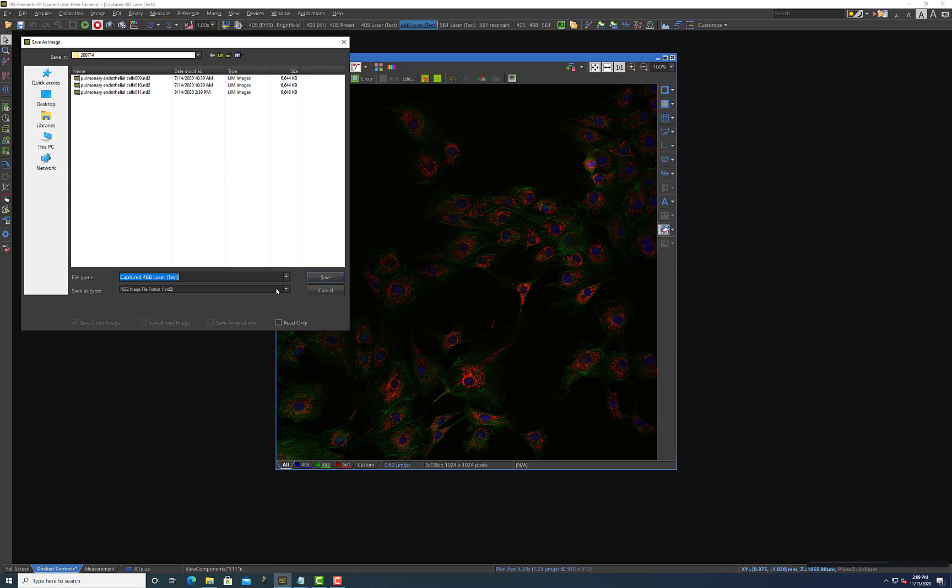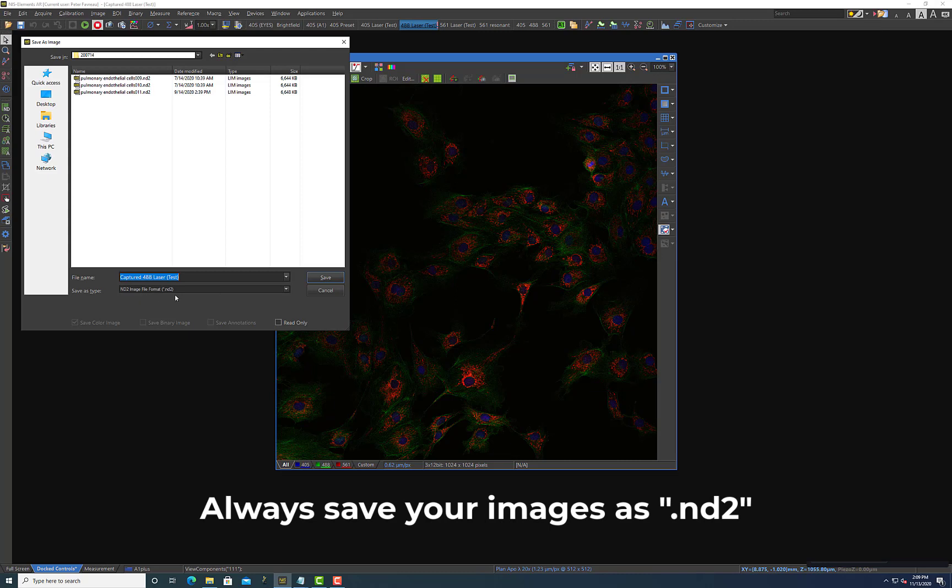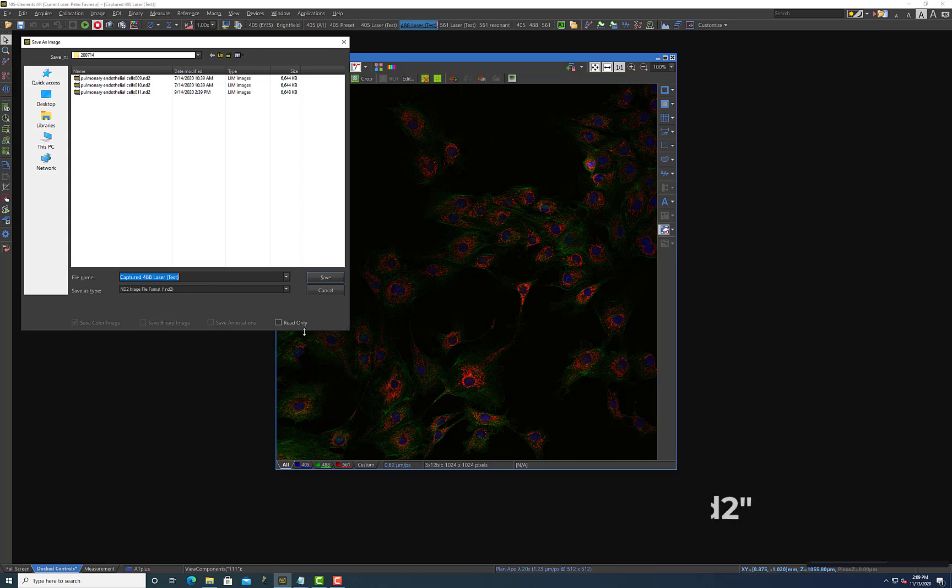So this is absolutely essential if you ever want to do any analysis on your image within elements or not lose any information after acquiring the data through compression or something to that end. So this should always be your first step. Make sure that the images that you're acquiring are saved as ND2. If you take nothing away from this video, that should be the number one thing is acquiring an ND2 image.